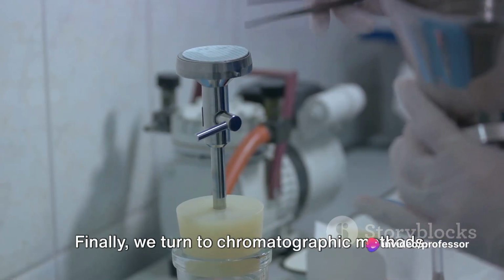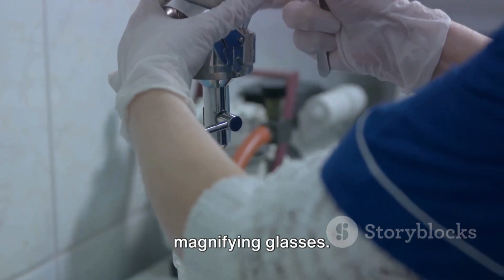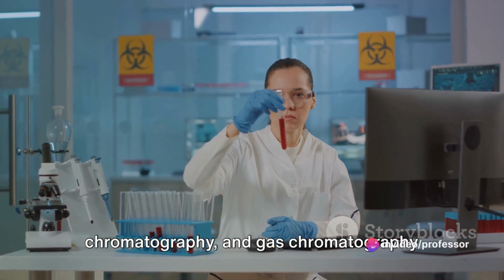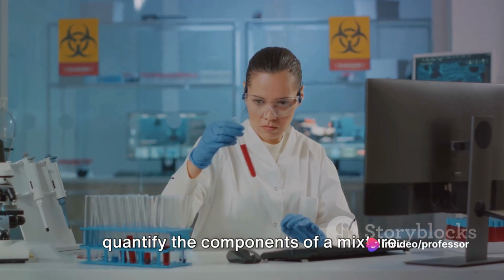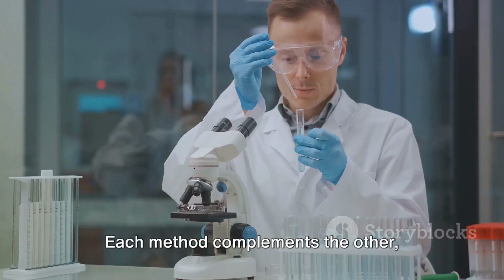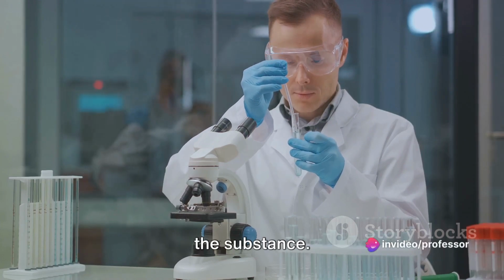Finally, we turn to chromatographic methods. These are our fine-toothed combs, our magnifying glasses. Techniques like thin-layer chromatography, high-performance liquid chromatography, and gas chromatography allow us to separate, identify, and quantify the components of a mixture. They give us a detailed understanding of the substance right down to its most minute components. Each method complements the other, creating a comprehensive understanding of the substance.